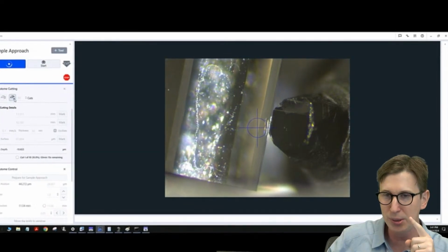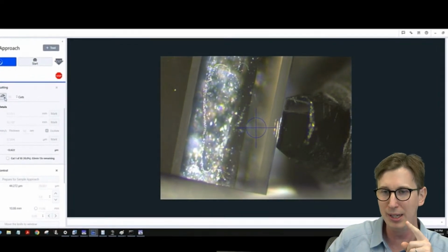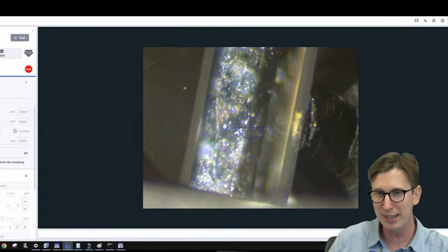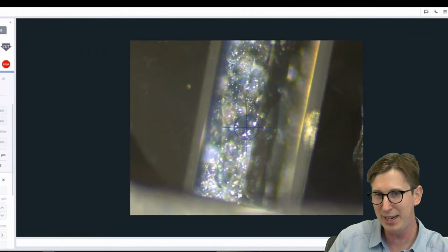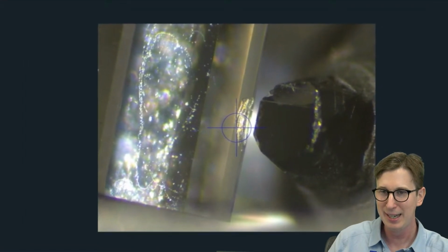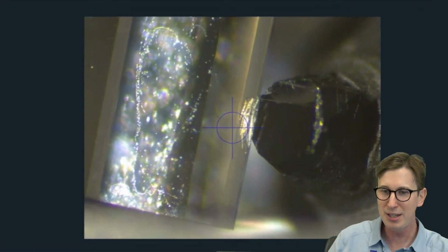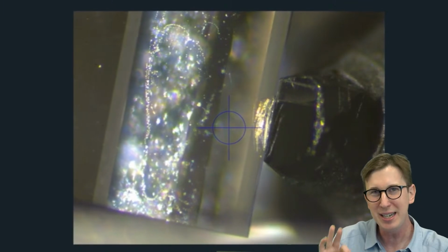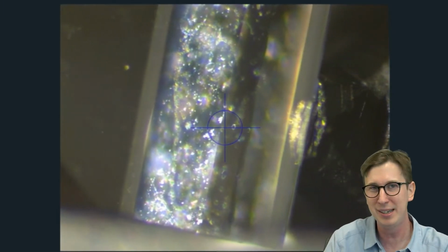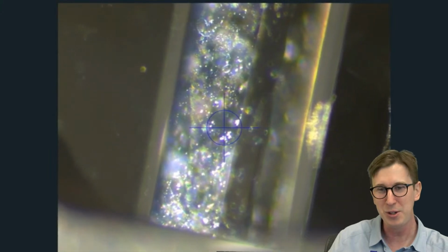This is through the camera on the stereo microscope mounted on the door, and we can actually monitor the cutting. So here's the first cut I've taken off the top of that block face, and we see it collect on the back side of the diamond knife. Now, each of these cuts is only 50 nanometers thin. That's over 2,000 times thinner than one human hair.